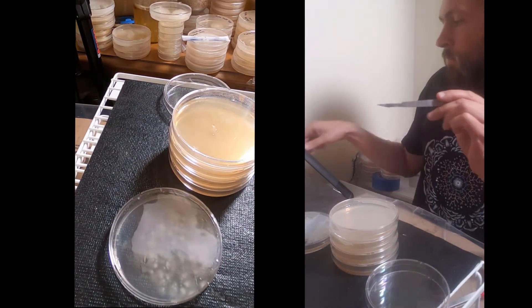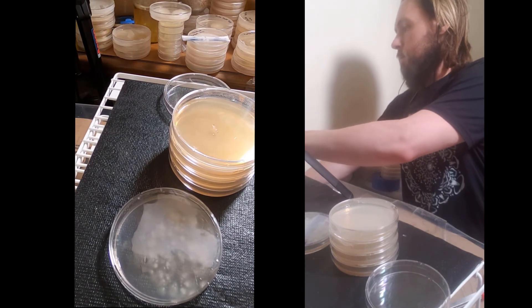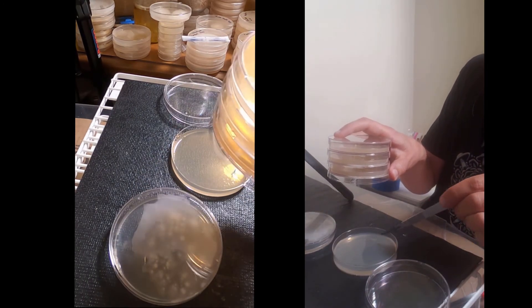I'll flame my blade again and go back to the initial spore inoculation plate, looking for an easily accessed leading edge after I cool my blade in the clean receiving plate.